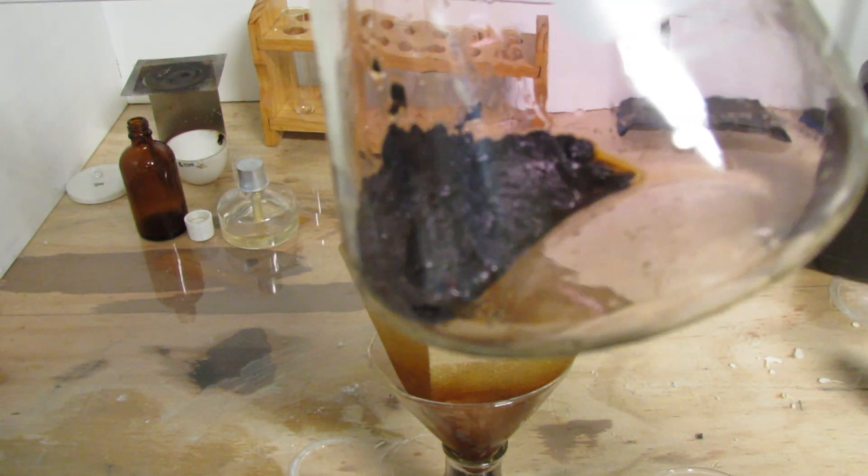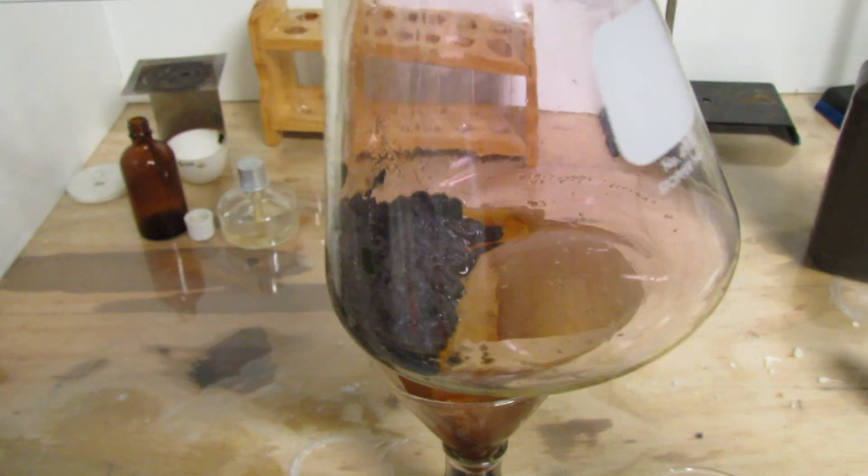In the bottom of the flask here you can see our final yield of iodine. This is impure, so I'm going to recrystallize it.